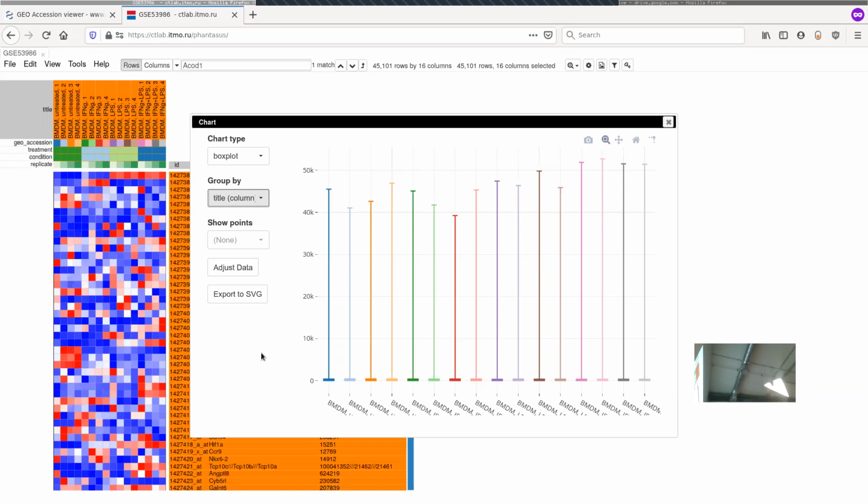So basically, there are two reasons why we don't want this. One is that the methods are developed to work with normal scale data, normal noise and so on. Another is that gene expression is not absolute, so it's not like concentrations in molar per liter or whatever.